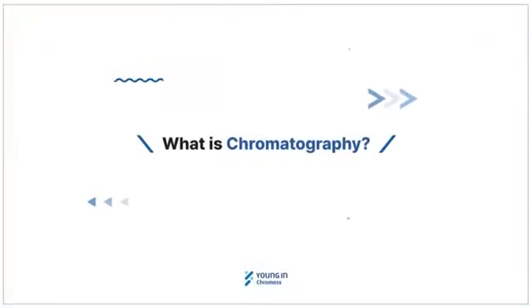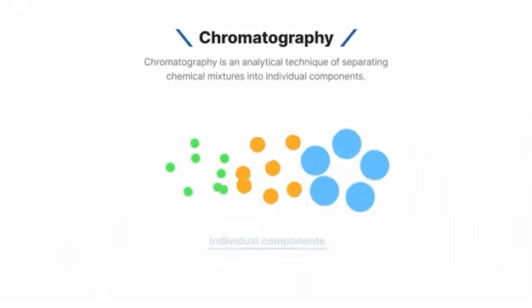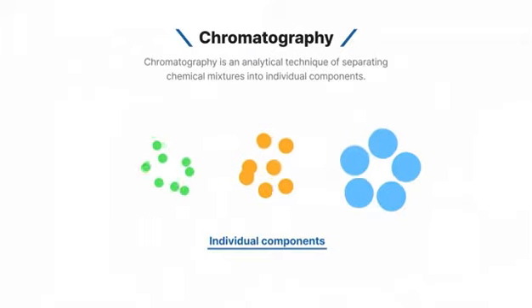What is chromatography? Chromatography is an analytical technique of separating complex mixtures consisting of multiple components. And how does chromatography work? Let's take a look at a simple experiment: paper chromatography.